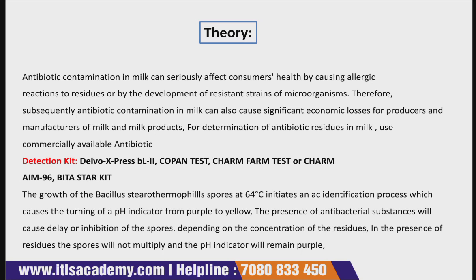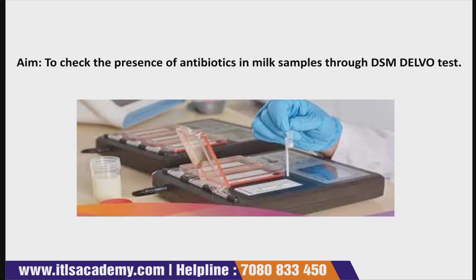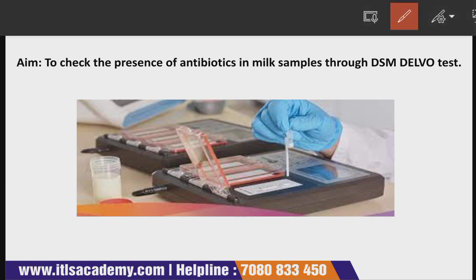So DELVO tests are the standard tests for the determination of the residual amount of antibiotics, or you can say sulfa substances, in the milk. I'm just writing what the DELVO test is. You can note it down somewhere. So what is the DELVO test?